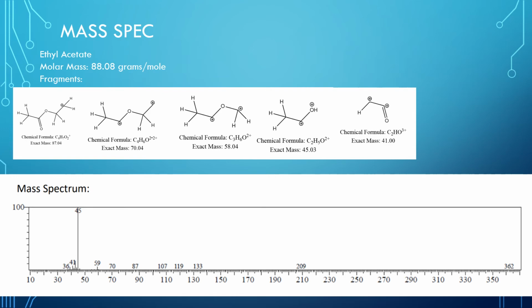The fragments of higher masses that are not seen as fragments are most likely due to interference from previous testing done in the machine if it was not cleaned well enough before the next test.